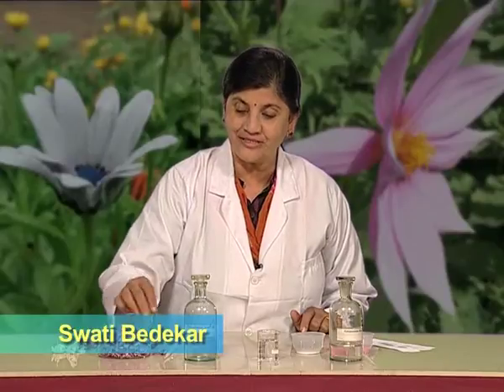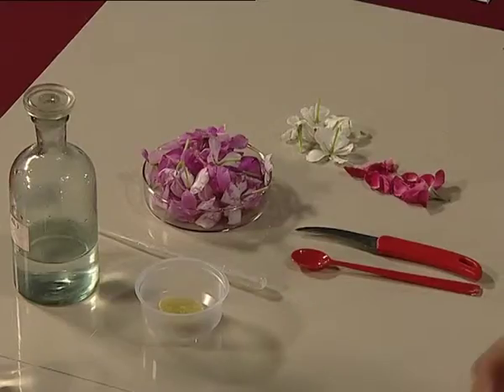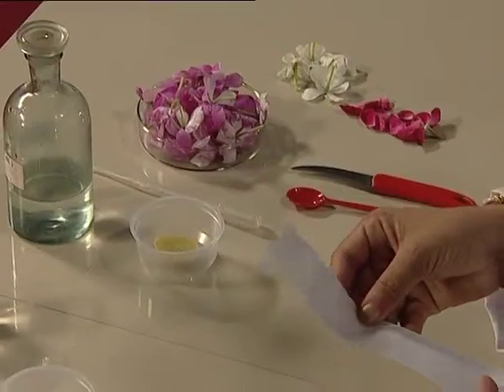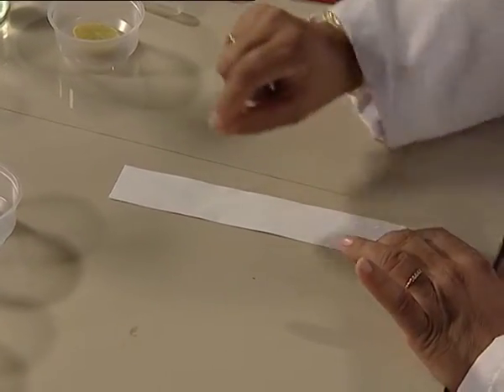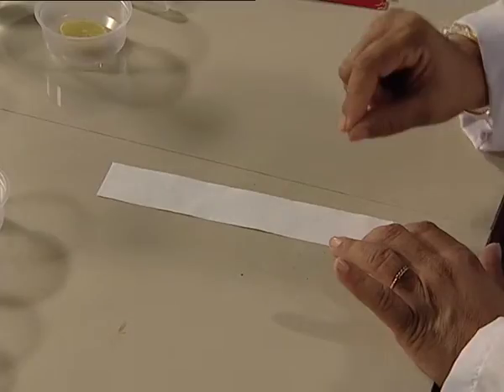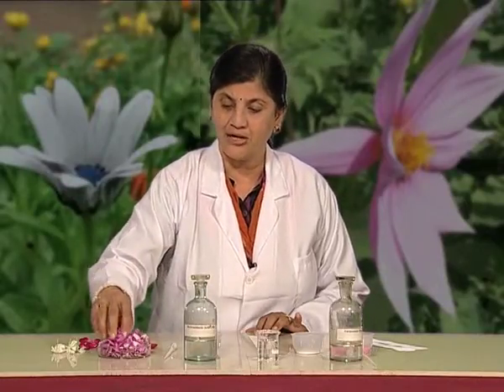Let us see how we do it now. I have here some beautiful flowers — Sada Bahar flowers, and you have to find out the botanical name for them. I am using a strip of paper, and I will slowly rub these flower petals on this paper and try to colour it. You can use any kind of paper; even your notebook paper will do.